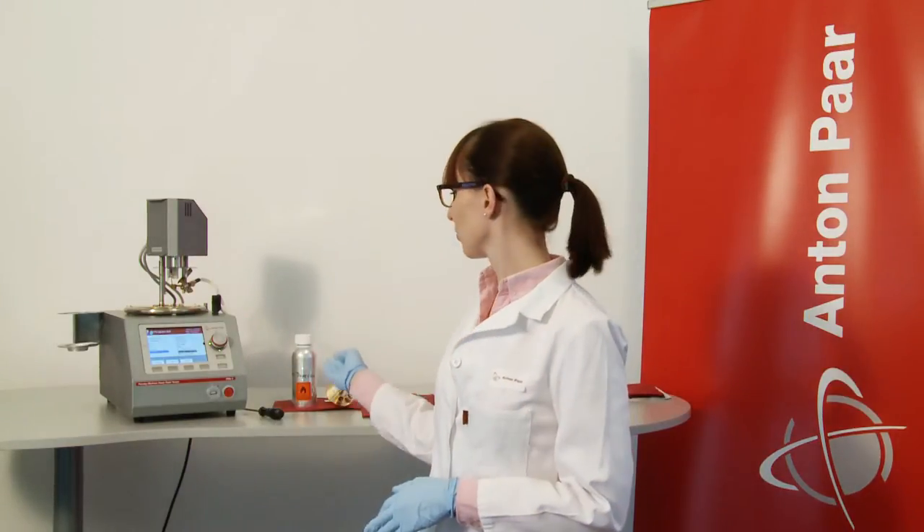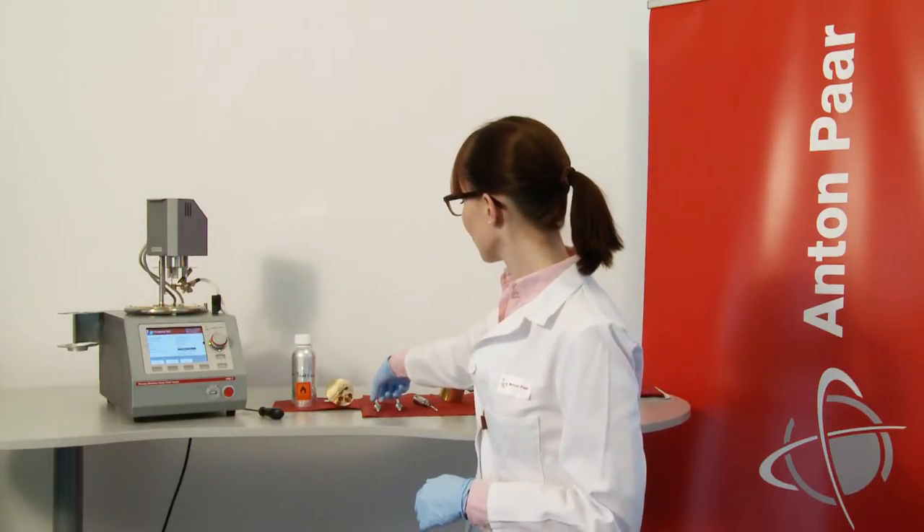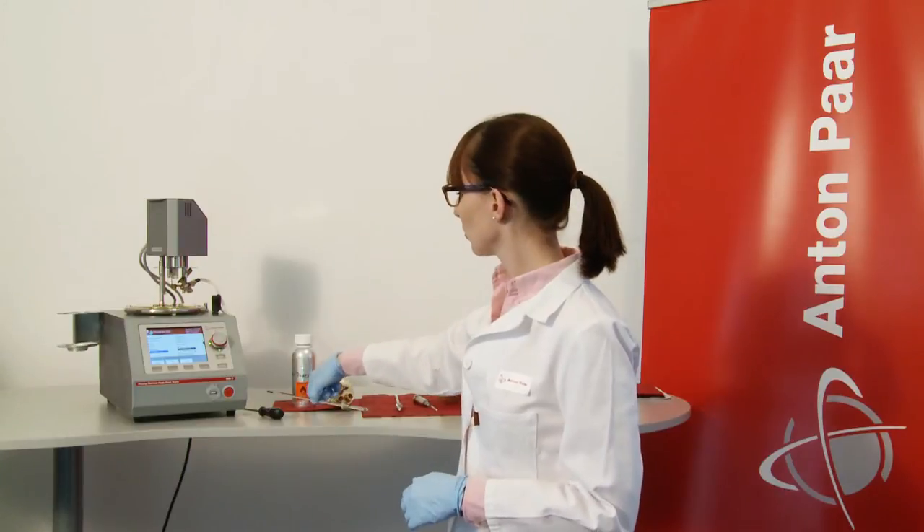Which sample should I use for calibration? For the low calibration, use a sample like Dodecane. For the high calibration, I recommend a thermal or silicon oil. Now we are going to use the program calibration low and employ the thermometer for lower temperatures, from minus 5 to 110 degrees Celsius.